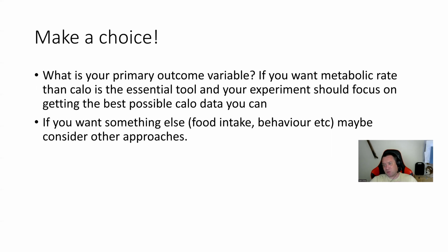I mean, the ideal world is if you can keep your mice in the calorimeter for days or weeks and they become fully acclimated to it and it just becomes their home. But many facilities don't have the luxury of running super long-term calorimetry experiments because the equipment is in demand. And if you're being forced to do short-term runs, you may also want to think about measuring other things like food intake, behavior, etc., using other approaches to complement the energy expenditure and metabolic rate data, where having a relatively short period of time may actually be more suitable.